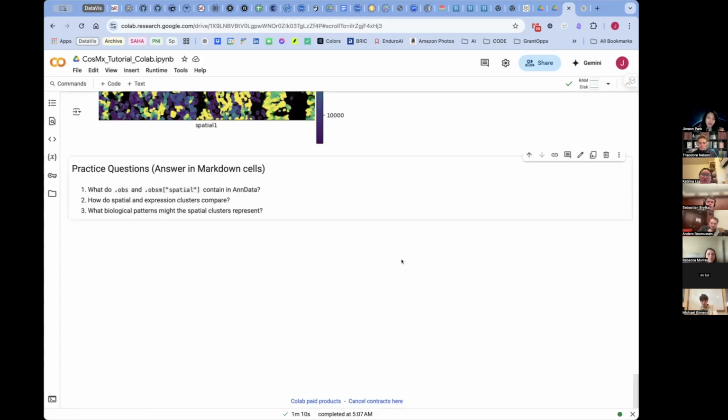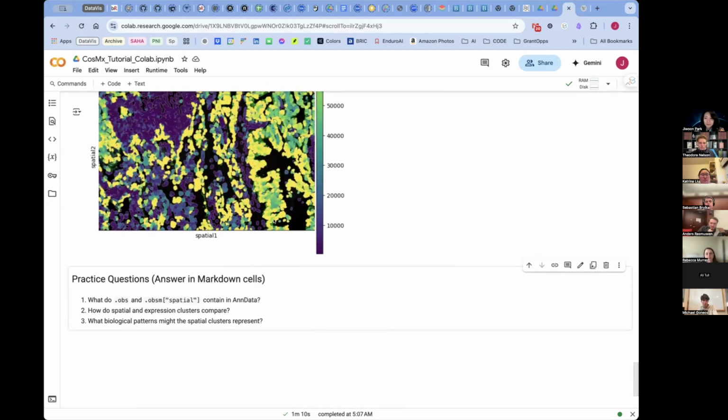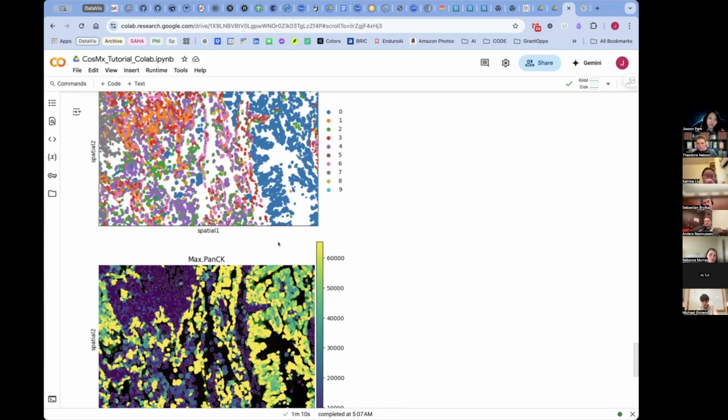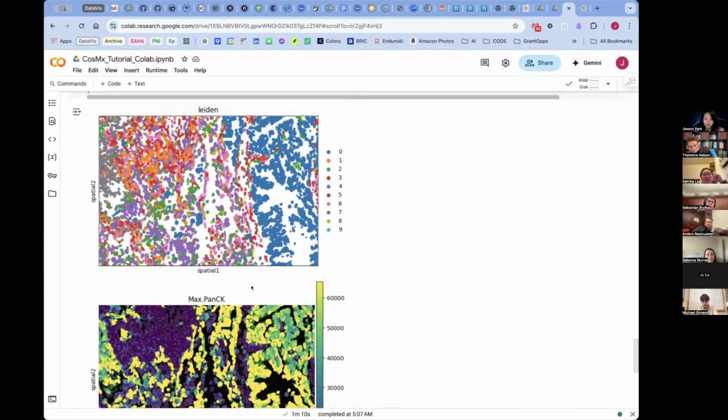And this is more open-ended: what kind of biological patterns do you want to see, or might you see, with the spatial clusters of cells? Yeah, cell types that interact. Yeah, communications, we do see a lot. Yeah, domain level information so that we can now start to segment: this is the alveolar region, these are stromal, like muscle regions, and tumor regions, non-tumor regions.